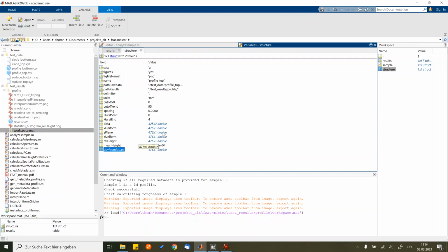This was it for this video. There will be another video on how to combine two height profiles, and then also for the other cases.